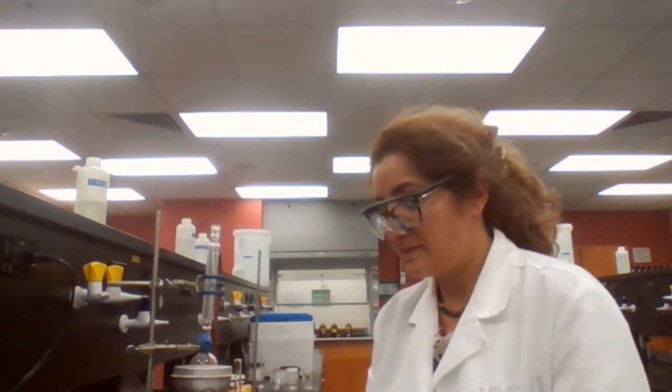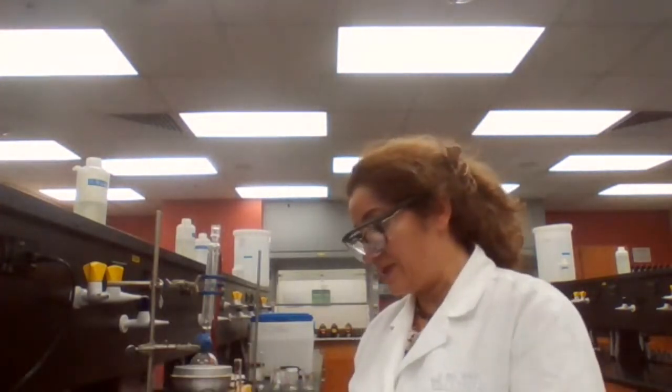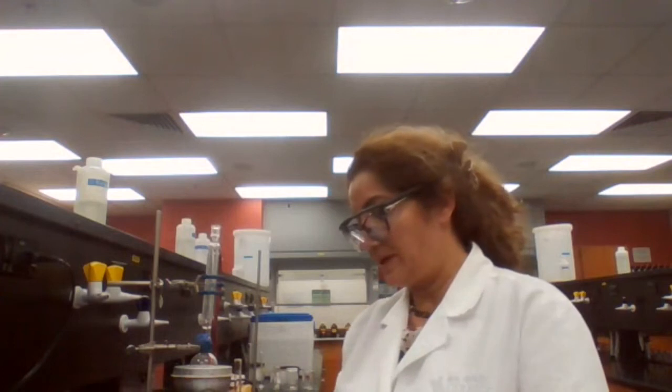Now, how long is the reflux? Again, about 45 minutes. We're going to time it for 45 minutes. And while we are waiting, I can answer your questions and go over the theory for the experiment. Today's experiment is esterification. So we are doing an esterification reaction. We bring a pen so I can write something for you guys.